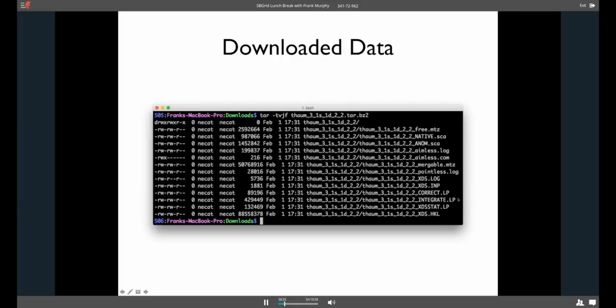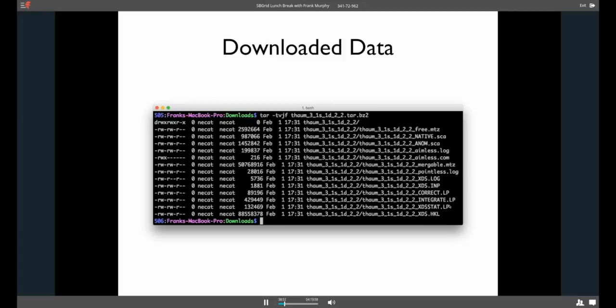You get a pointless log file. So, you can see what pointless thinks about your space group. We also give you all the XDS log files and input files. So, if you want to go through and, for example, run XDS again or change a parameter and run it again, you can base that off this input file. So, we want to make sure that you have all the data in several formats. So, you don't have to go remembering how do I get it into the format that program X is going to want. So, we give them all to you right up front.